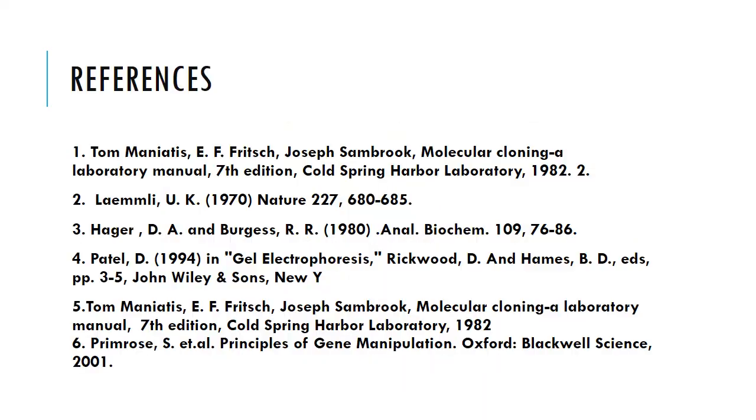So now they are moving. Once we apply the electric field, this is the initial placement, the proteins are on top here. Once electrophoresis has taken place, remember we said that smaller molecules will be moving downwards faster than the bigger molecules. So smaller molecules will move downwards, followed by these molecules that are a bit bigger than these, and then the largest molecules will be on top. So in this case we can tell that separation has taken place.